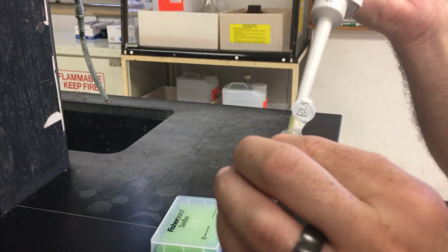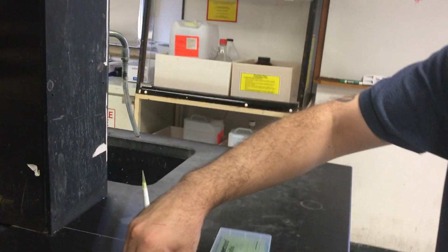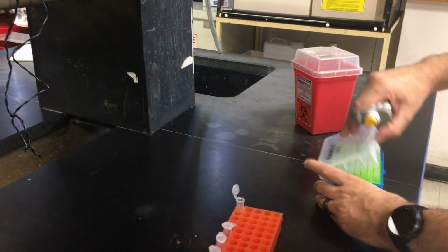And then remember you have to push all the way. Wait a second, all the way. You can see that the volume is there. It's that drop, the 5 microliters. Just grab the waste container. So the DNA has been added.